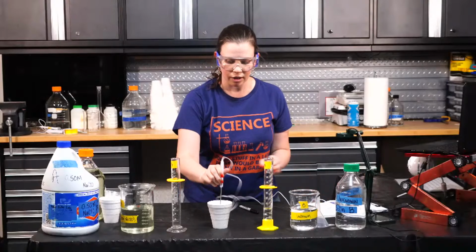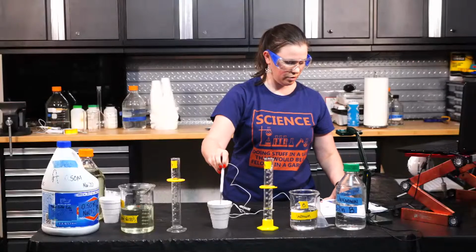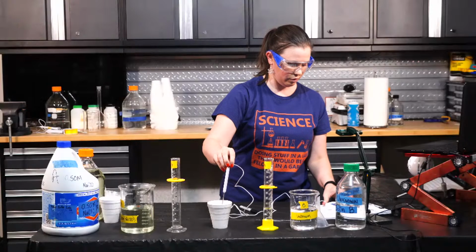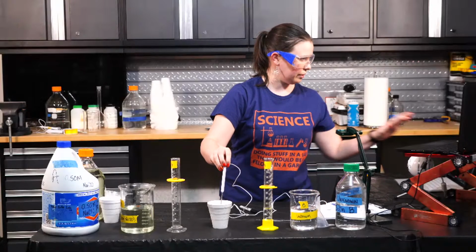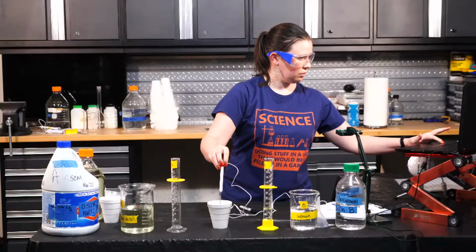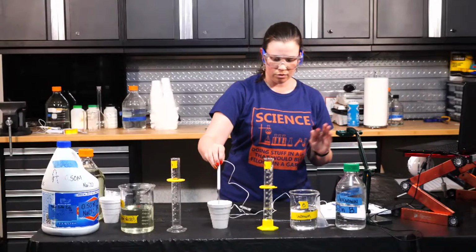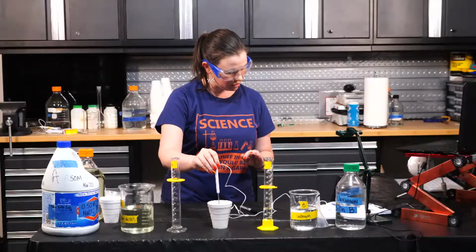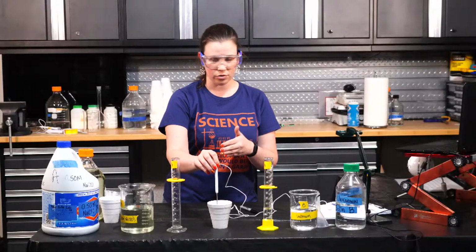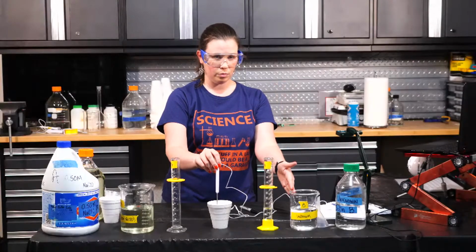So I've got my probe, and if anyone's interested, I will show this on the dot cam in Zoom. I'll also read it out loud, of course, because I know a lot of you don't want to be bouncing in and out of breakout rooms like crazy. So there's the dot cam, just in case anybody wants to come see it. So right now, the temperature of just the bleach is 19.0 degrees Celsius. Again, this is level 2, 19.0 degrees Celsius, before I've mixed solution B.